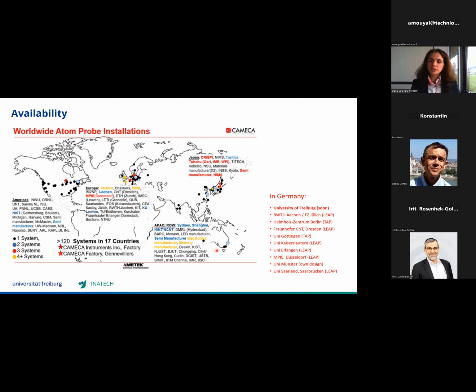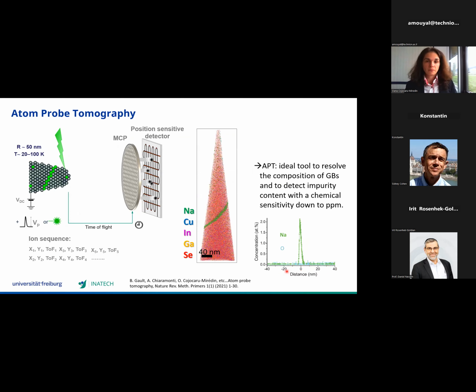If we look in Germany, there are several universities, mainly the biggest universities, that have an atom probe available. And this is also the case of the University of Freiburg, where I'm sitting nowadays, and I'm going to receive soon a LEAP 5000 system.